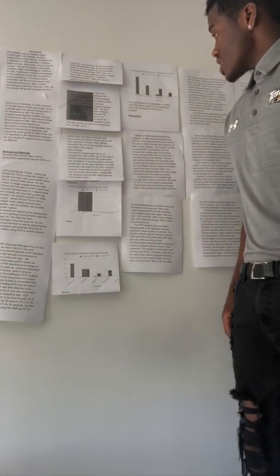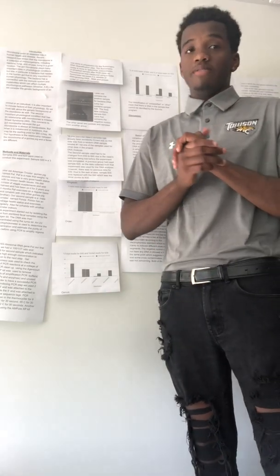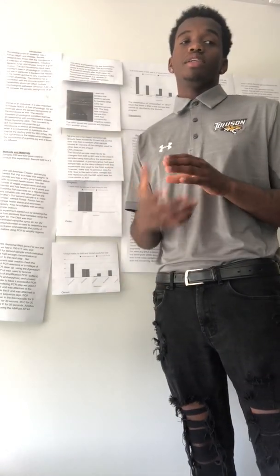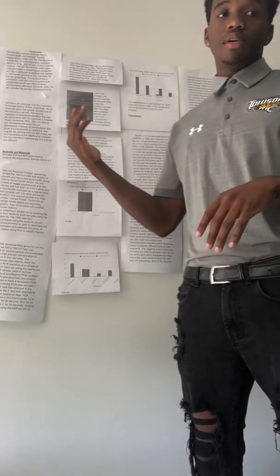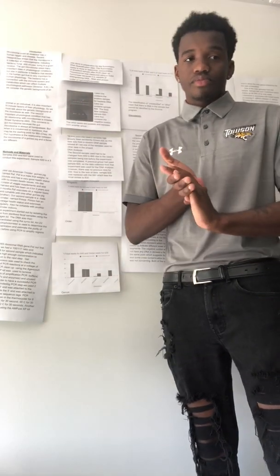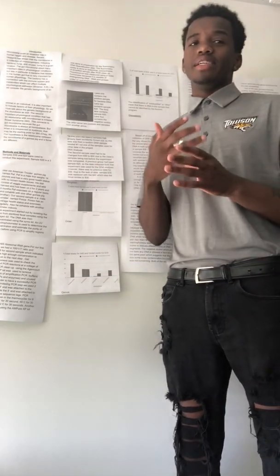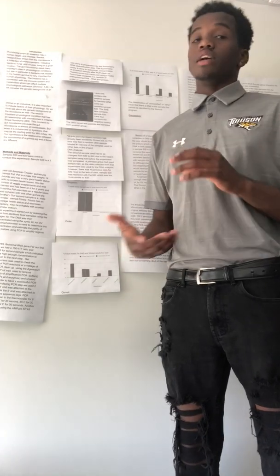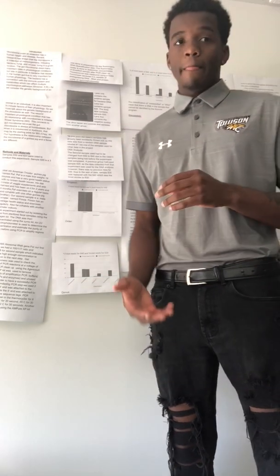Okay, so electrophoresis. Electrophoresis shows the extraction of DNA and how successful it was, because of the fluorescent lines. As seen in the pictures indicated, when the concentration is high, there should be more than 100 nanograms per 50 microliters by the UV NanoDrop spectrometer.